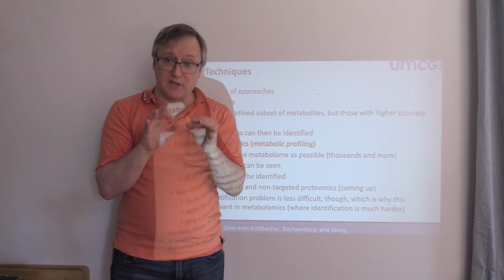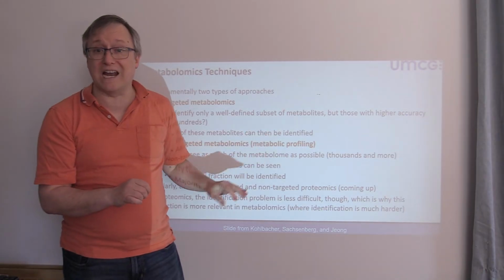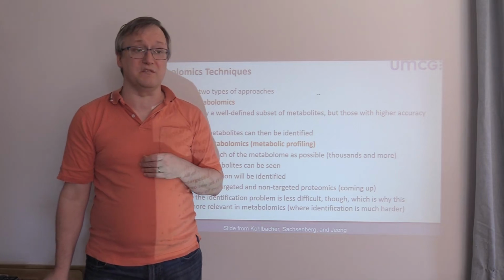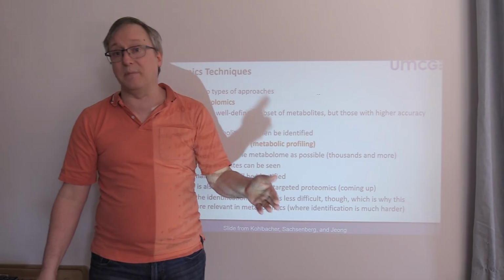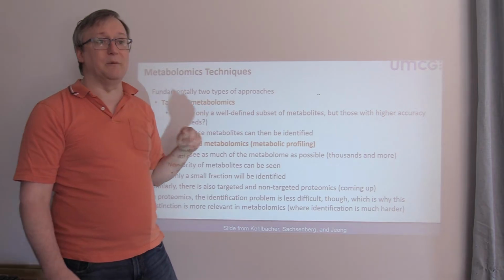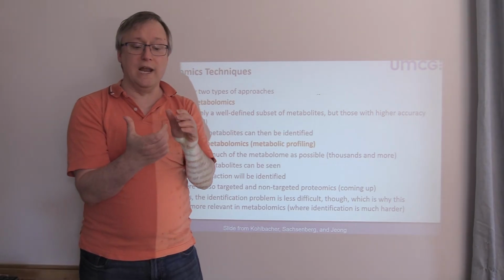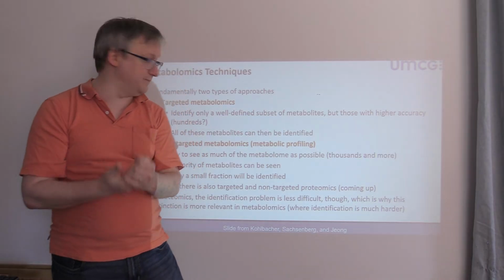With that kind of specific detail, it becomes possible to quantify a metabolite very accurately. And that is what we use in targeted metabolomics. Specifically, you may want to target as many as 100 different metabolites in a single LC-MS experiment. So for that, targeted metabolomics is going to require that we have a predefined list of precursor ions that we want to look for, and often a predefined list of which fragments to expect for them as well.